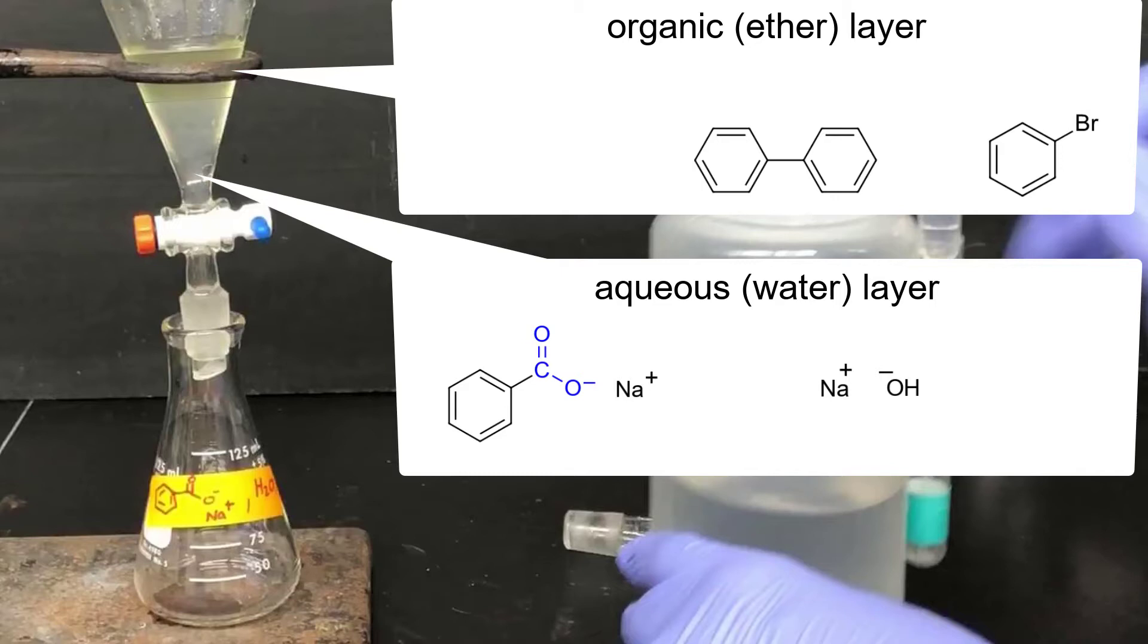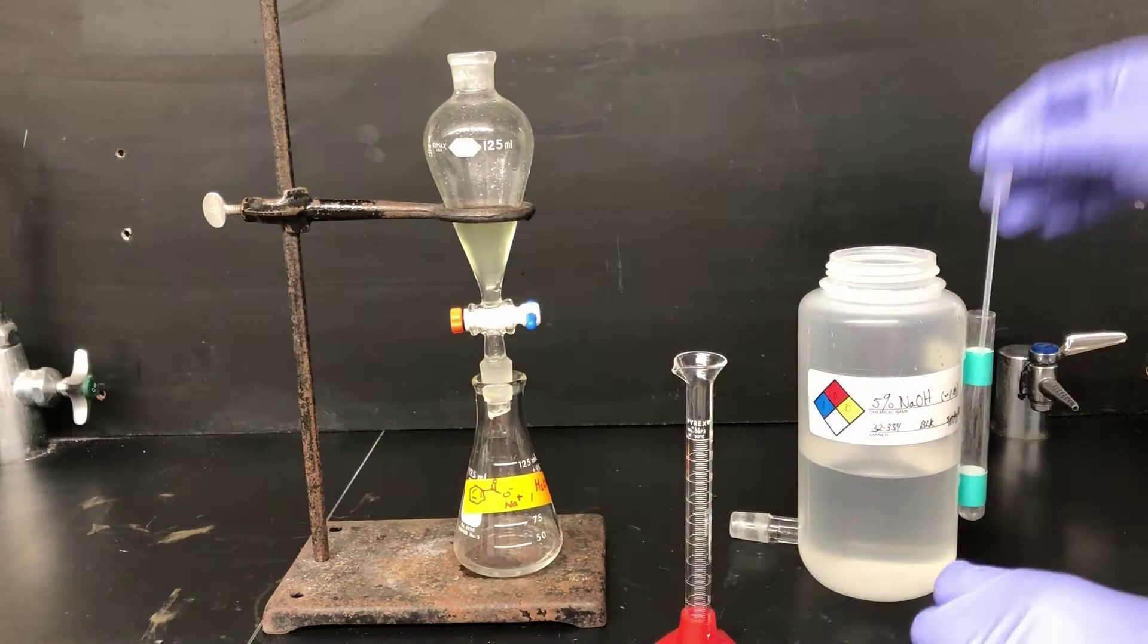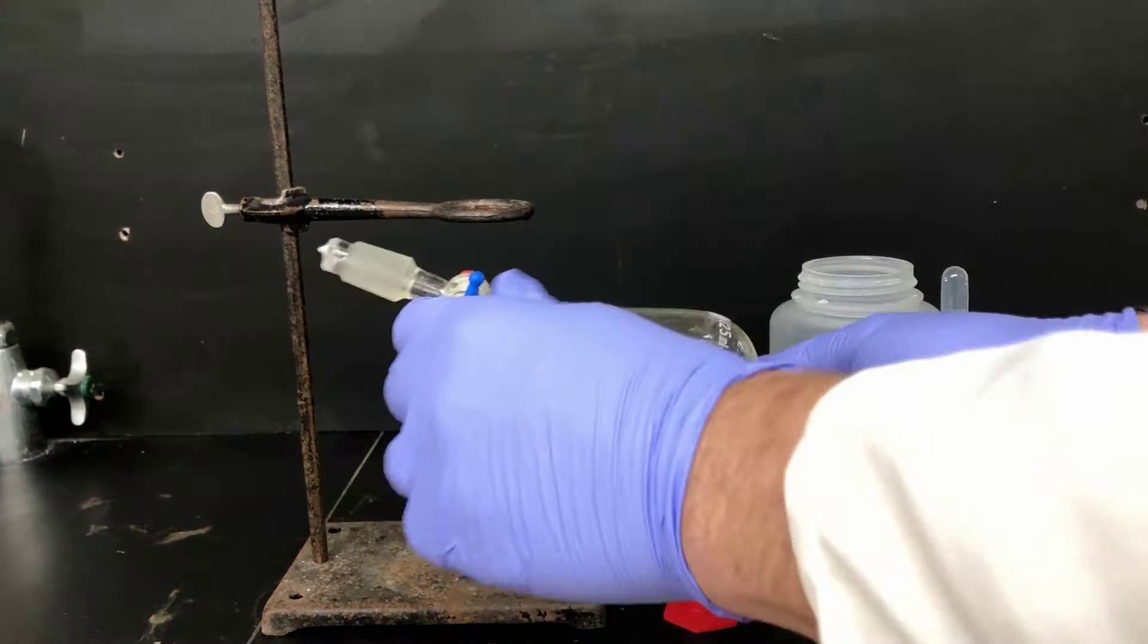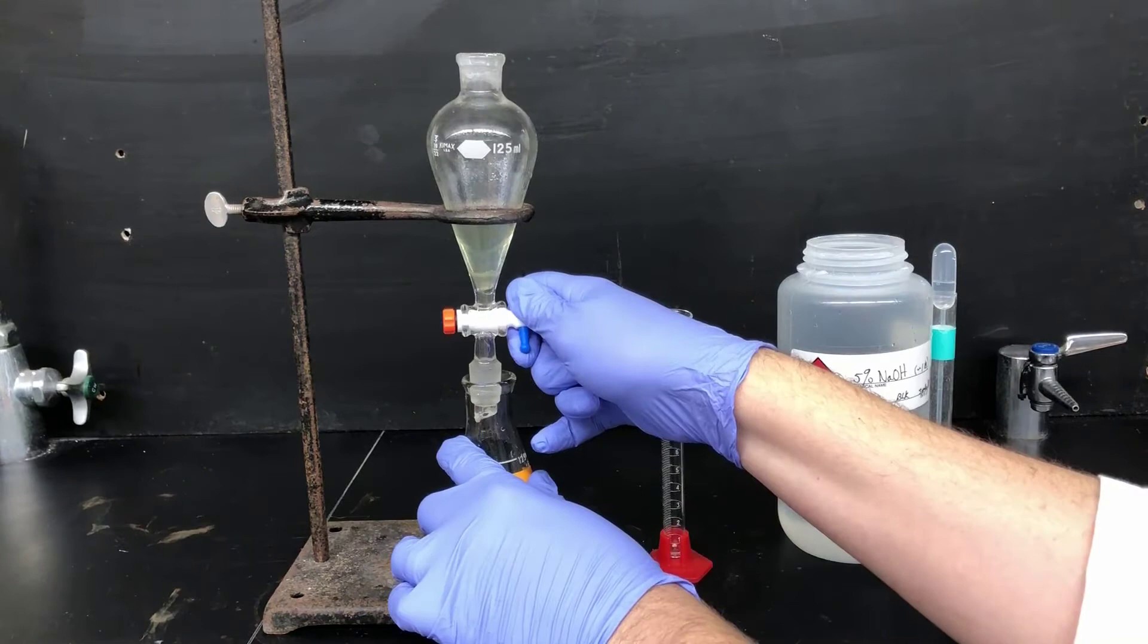This is my first extraction of the ether layer with aqueous sodium hydroxide. It will get most of the benzoic acid product deprotonated as sodium benzoate, but I want to repeat the process a couple more times to ensure that I get a better yield. So, here I'm measuring out another 8 milliliters of the 5% NaOH, and I'll put that in the separatory funnel, shake it, allow the layers to separate, and then drain the lower aqueous layer, and combine it with the aqueous layer from the previous extraction. Then I'll repeat that extraction one more time for a total of 3 extractions with 8 milliliters of sodium hydroxide solution each.